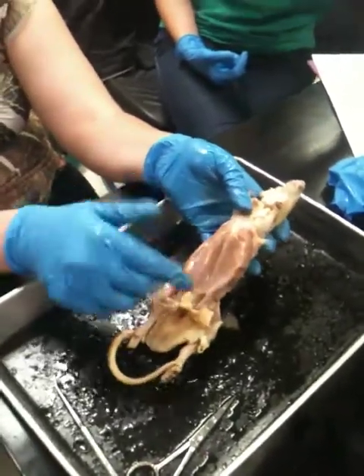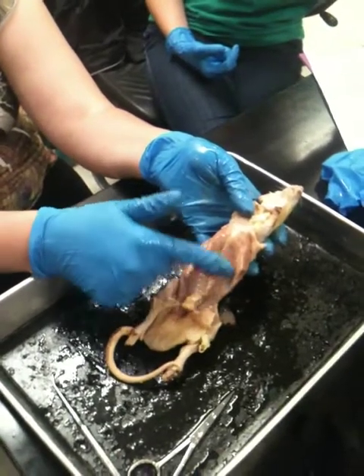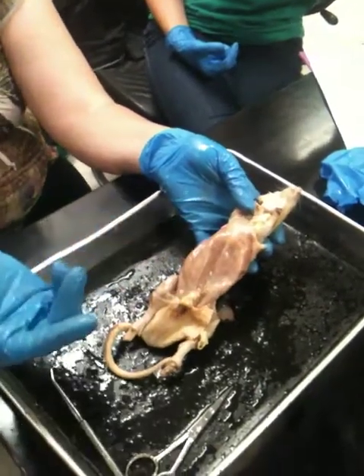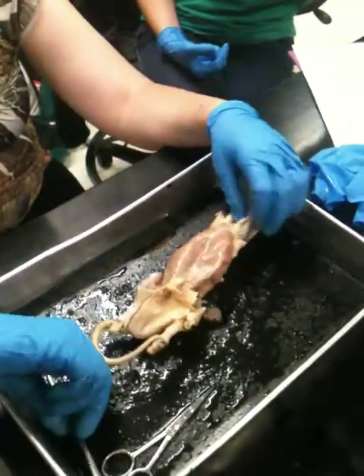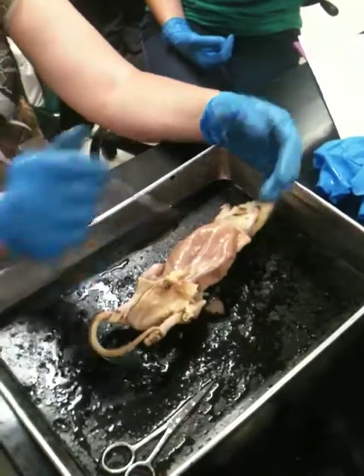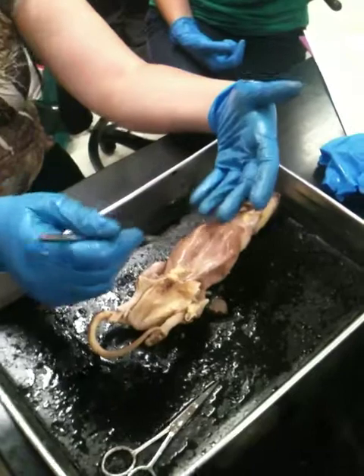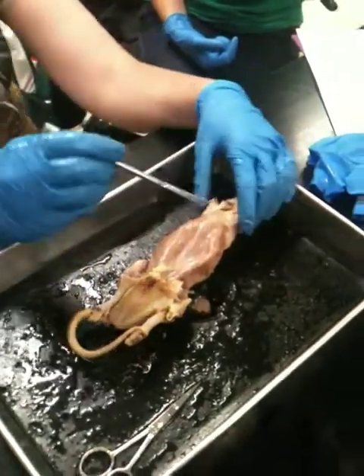So when we talk about the subdivision, this is not an abdomen for a subdivision. It is an abdominal subdivision. So think about adjectives here. And it's important because on the practical, I will have pins. Obviously, I'm not going to have 50 pins going around the abdomen structure or abdominal subdivision.